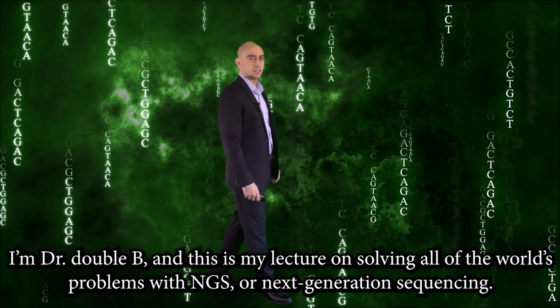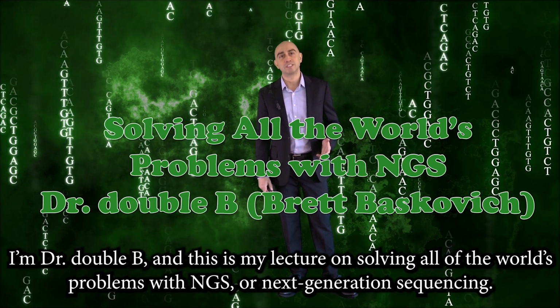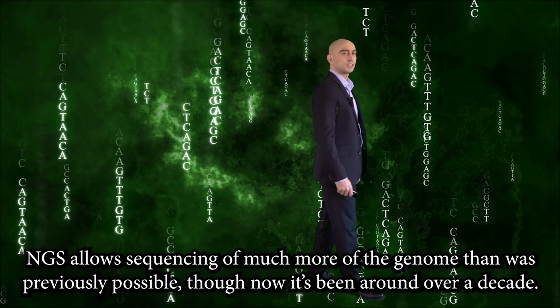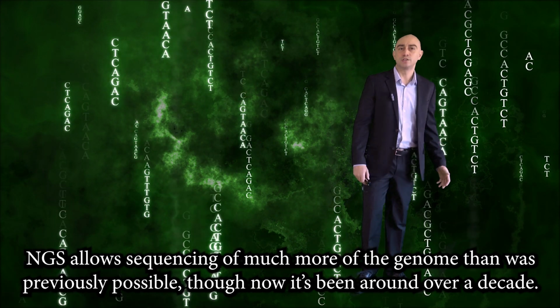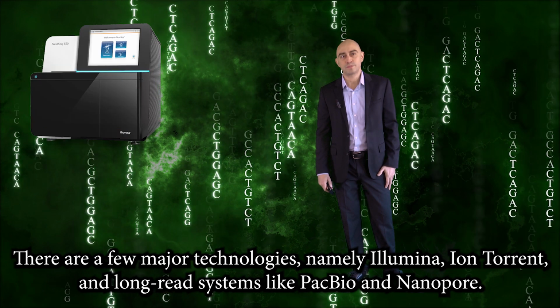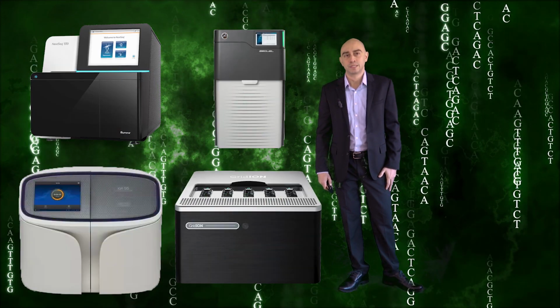I'm Dr. Double B, and this is my lecture on solving all of the world's problems with NGS, or next generation sequencing. NGS allows sequencing of much more of the genome than was previously possible, though now it's been around over a decade. There are a few major technologies, namely Illumina, Ion Torrent, and long-read systems like PacBio and Nanopore.